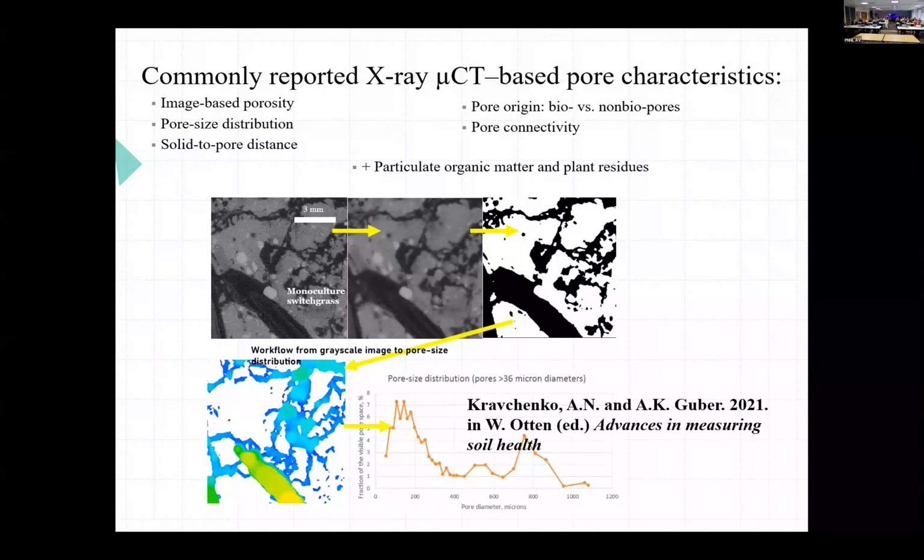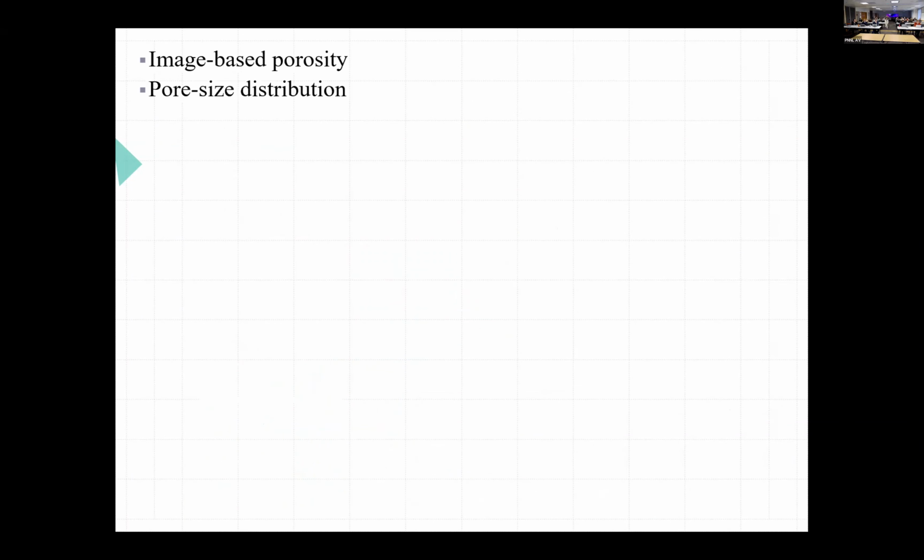So finding the proper settings for cleaning, for filtering, for segmentation, that's always been a struggle for us in making the perfect decisions. That's why I think you're so lucky to have Tomas and his team to do this very important and sometimes very hard work for you. And it is important because what you get as far as the data very heavily depends on the decisions that are made during filtering and segmentation stages.